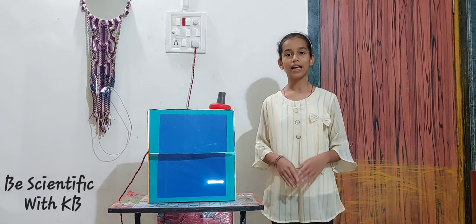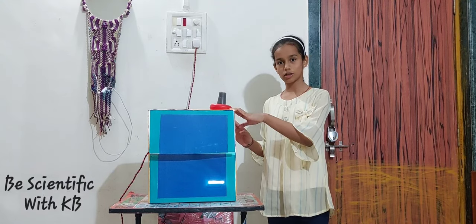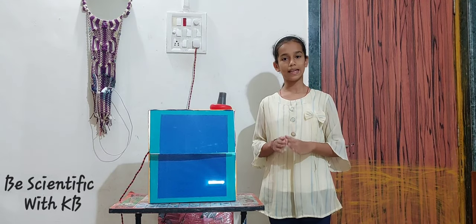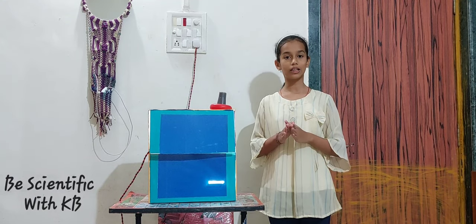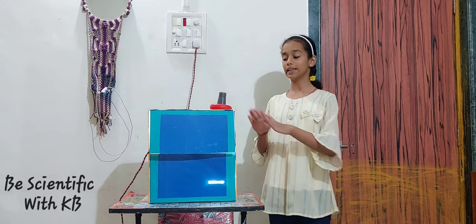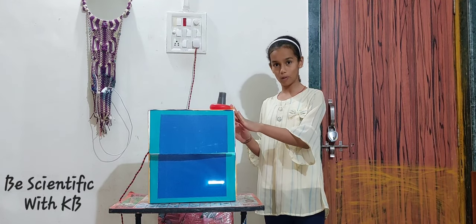My name is Arya Gavade and I made a Chinese model. Its name is Boxerscope and Boxerscope is like a microscope. If you are going to buy a microscope, it gets costly — 5000 — but this is a very simple and very homemade microscope.